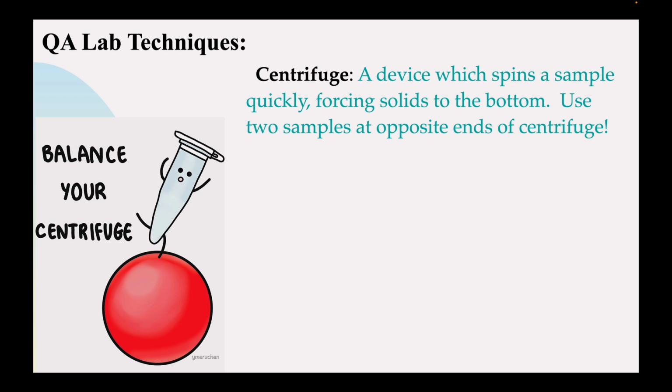By doing that, gravity pulls the solids to the bottom of your tube, and the liquid, the parts that aren't solids, then stay above. That's a pretty cool thing. Centrifuges are something you might have seen in movies. Just kind of realize it.